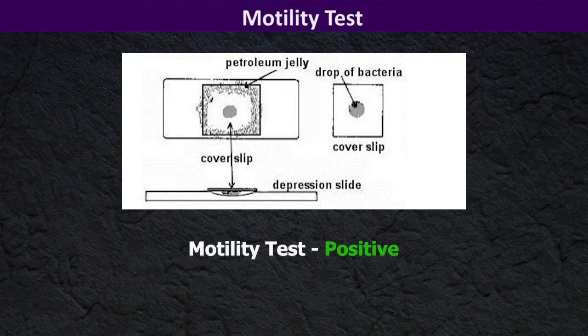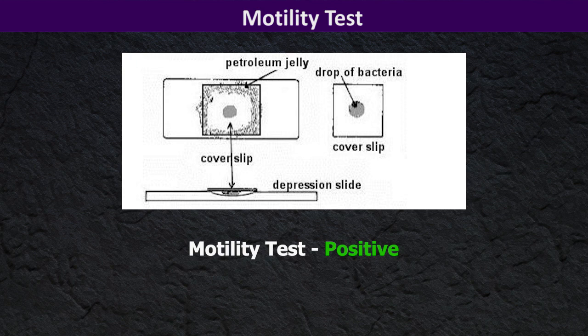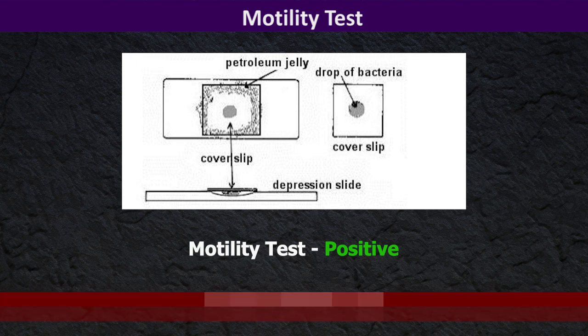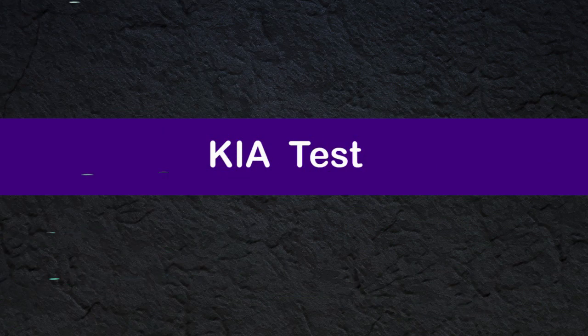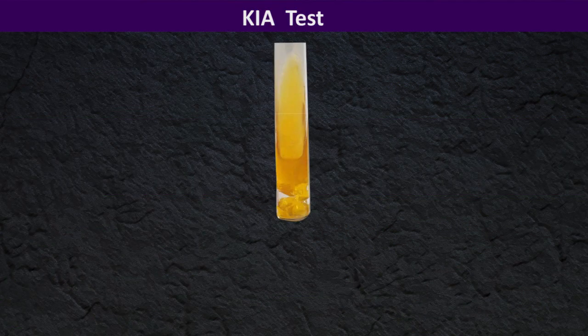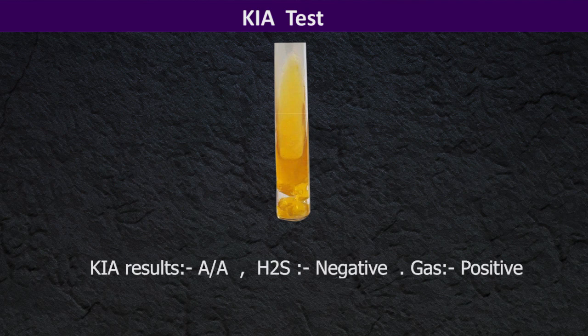Then you can perform the motility test and it gives positive motility which excludes Klebsiella species. TSI results: alkaline/acid, hydrogen sulfide negative, and gas positive.